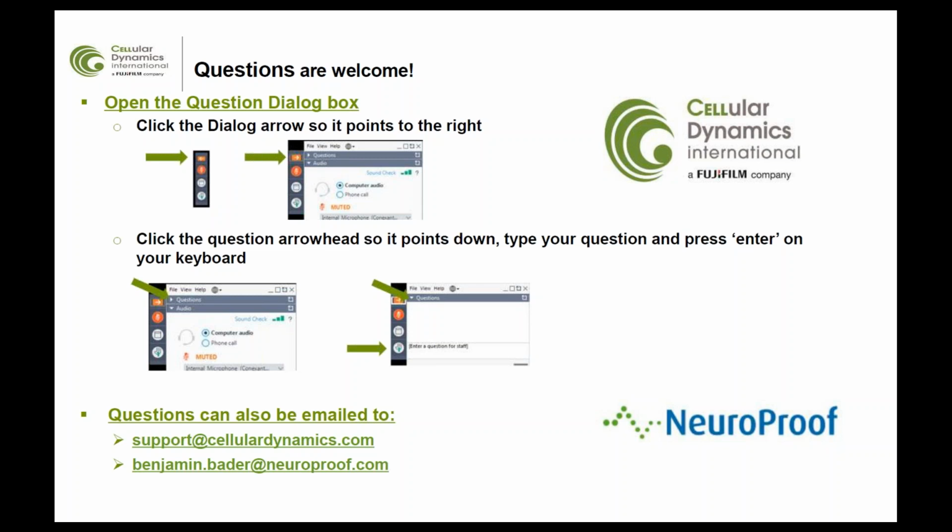Okay, thanks, Ben. And then another question, and this is pertaining specifically to a part of the CDI presentation, but then I'm sure, Ben, you can speak on this as well. The term network velocity, could either of you just elaborate on the meaning, or how does one use that value to interpret data?